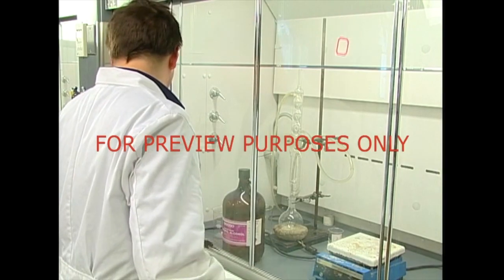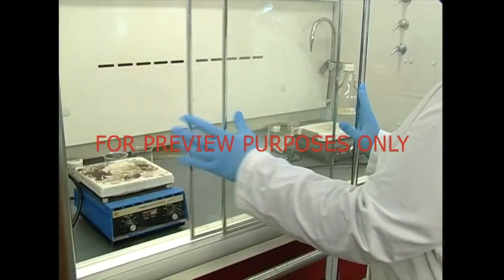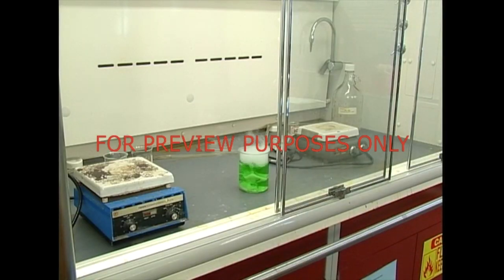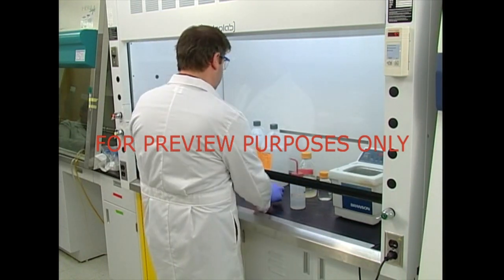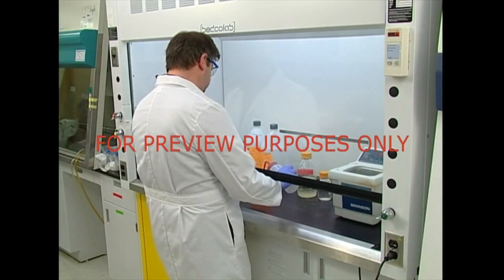You also need to know how to use ventilation controls, such as lab hoods. When it's working correctly, the airflow within an exhaust hood effectively confines and removes released vapors. An invisible curtain of air blows across the opening and keeps vapors from escaping under the sash. But you still need to keep the sash as low as possible.